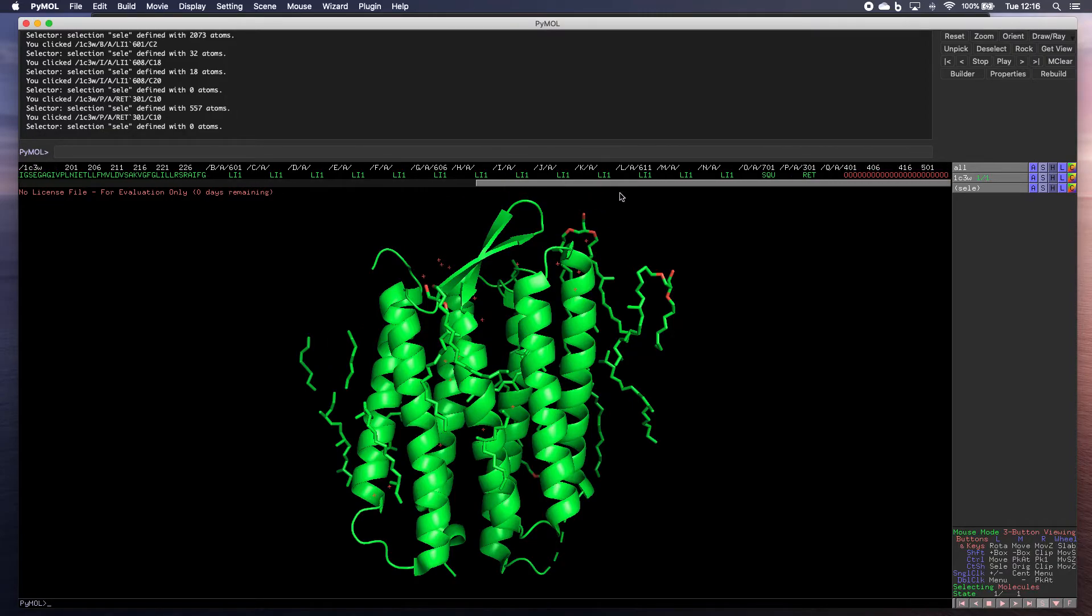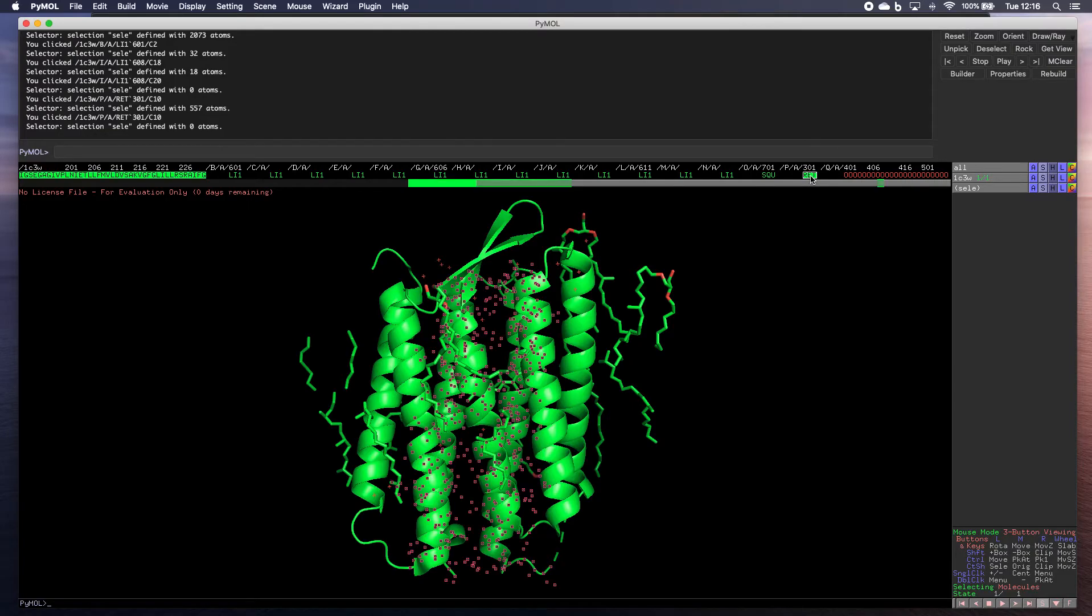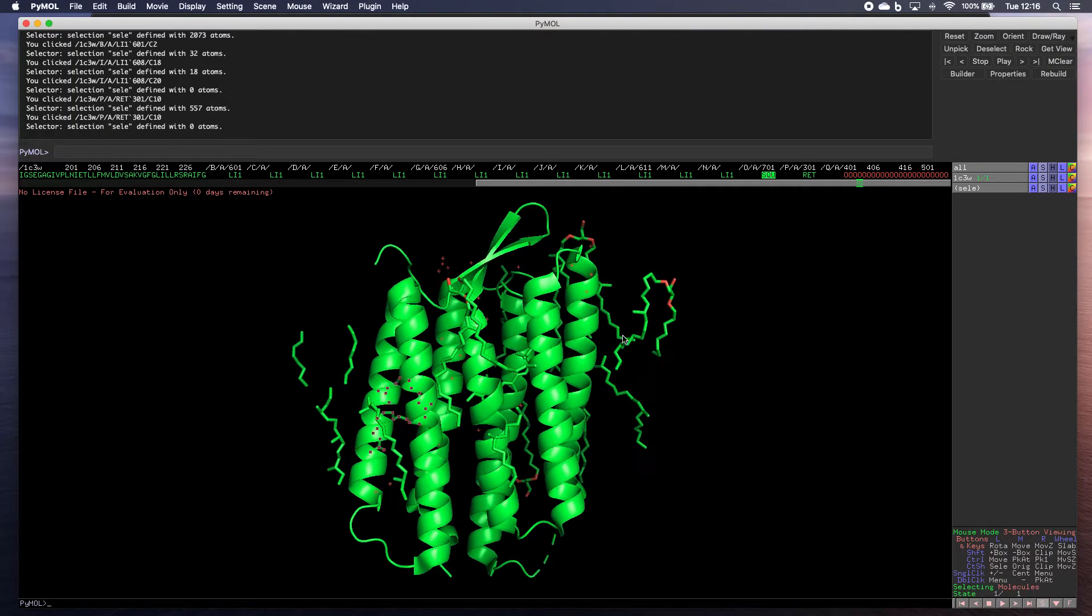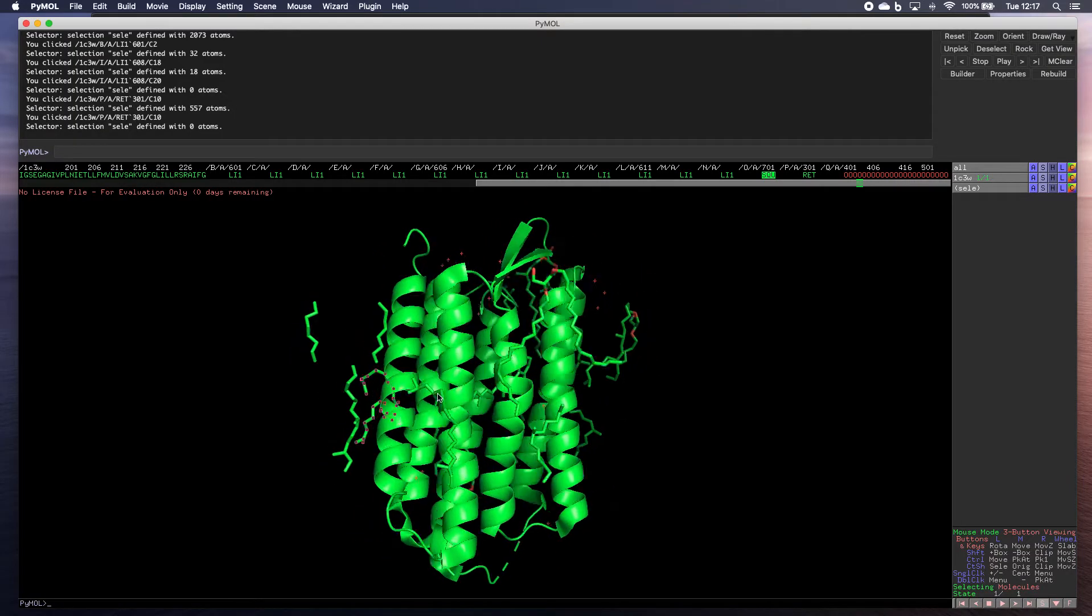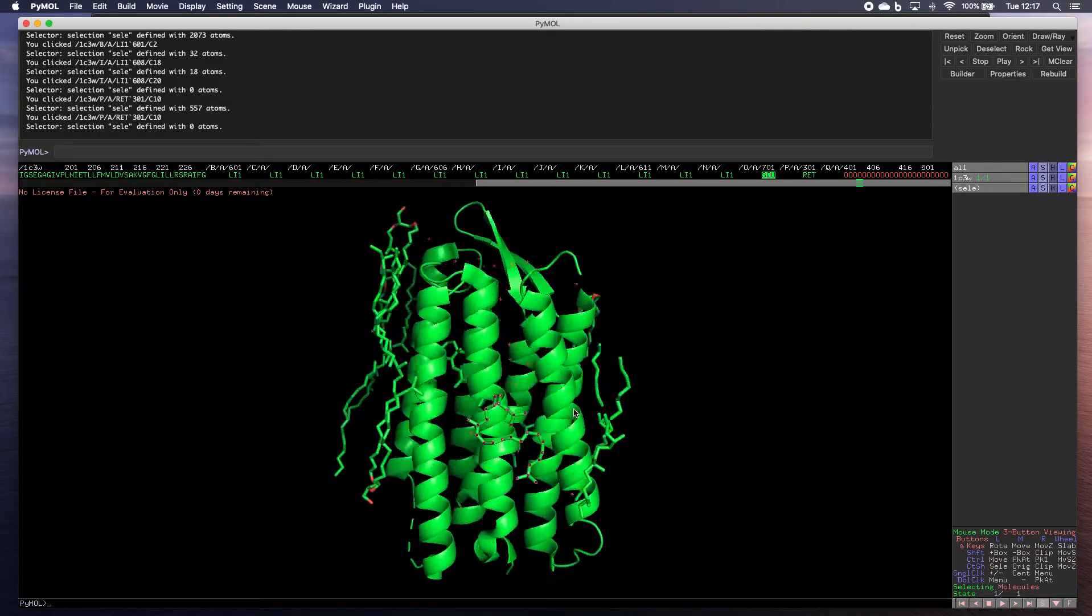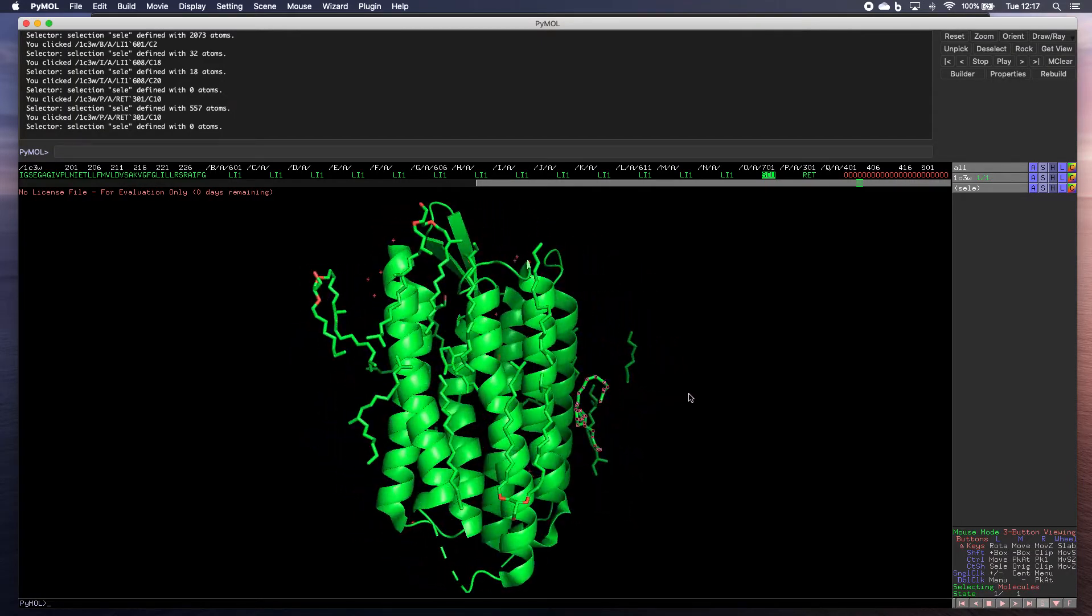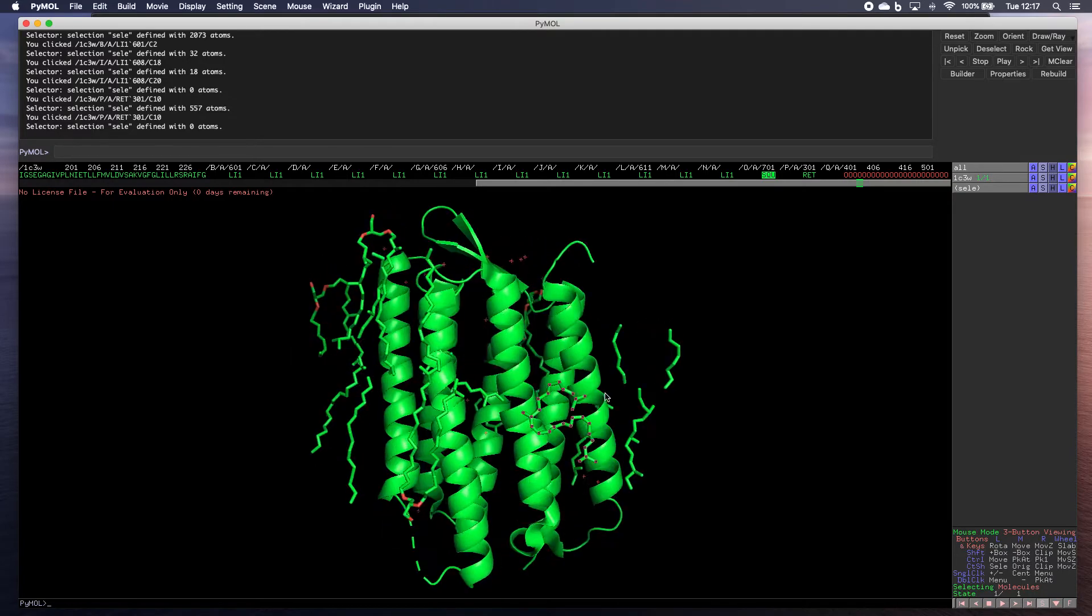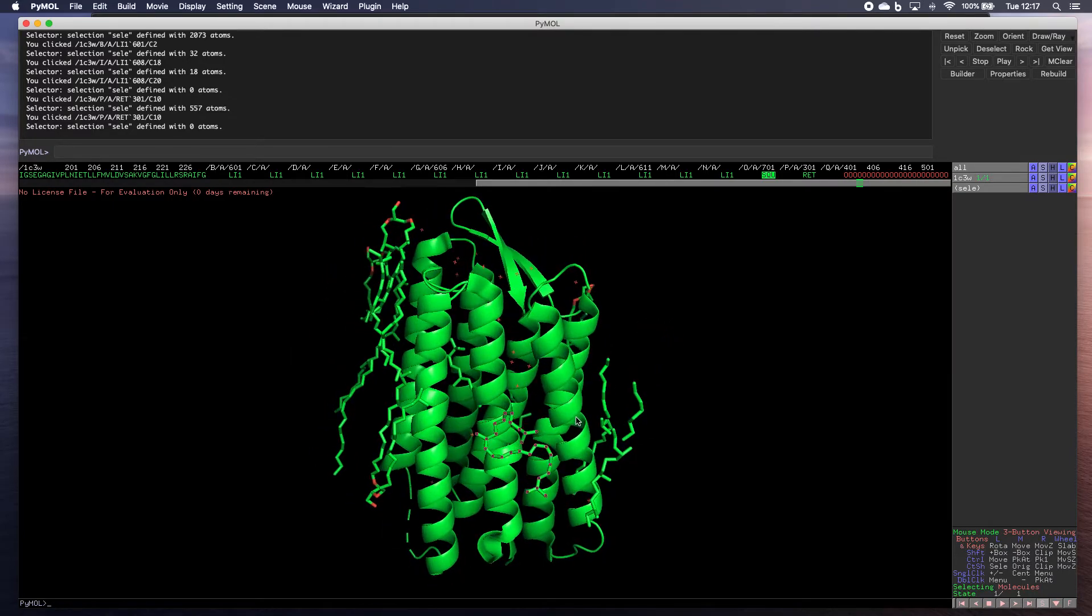So for example, if I just want this particular part, I click on there, that one even. And now just that molecule there has been selected.